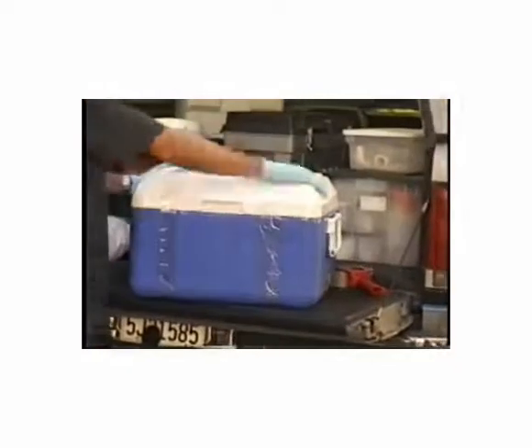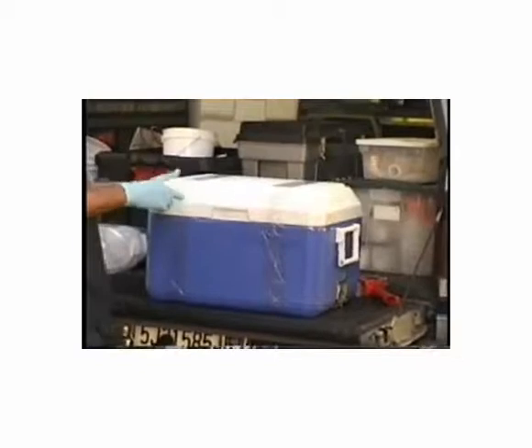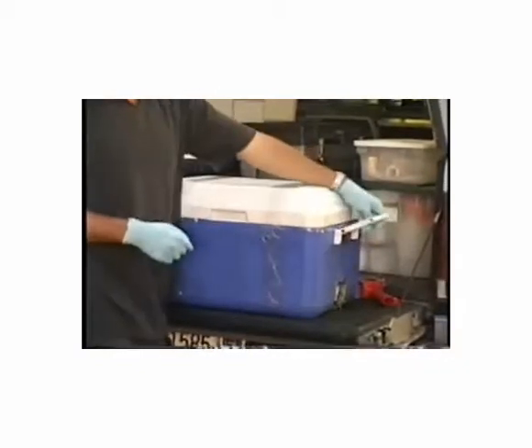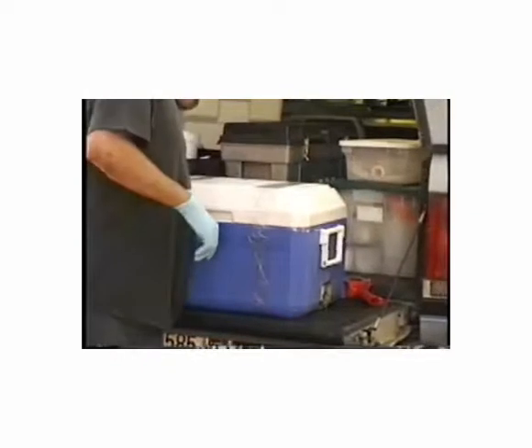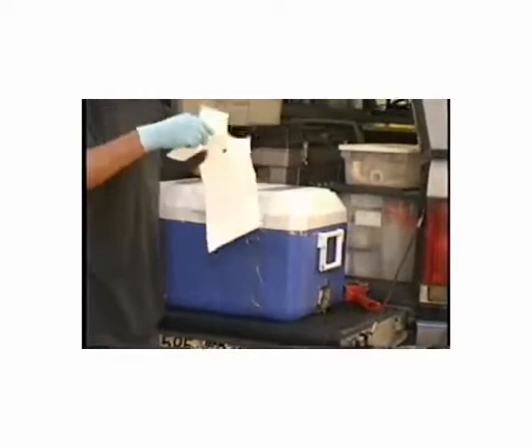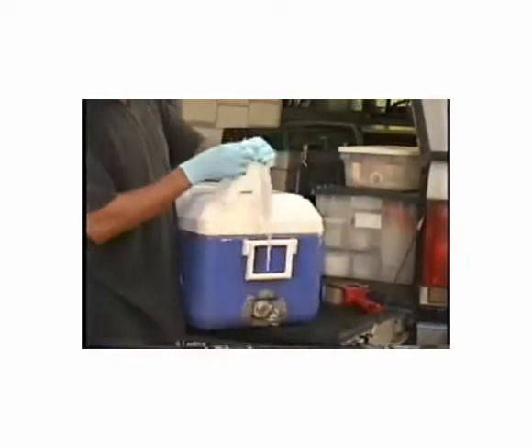We then want to attach a shipping label, and the ideal way to do this is if you have a handle on your cooler. There are usually fasteners that you can use to fasten to the cooler.